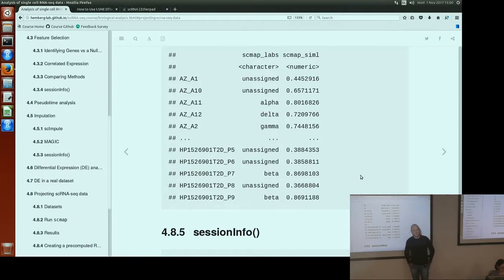So the question is, here we're storing median values of expression in a cell type. Can we store the distribution of the values in a cell type? I mean, for our purposes, we don't need to do that. You probably can, but then storing the distribution is probably the same as storing the whole original expression matrix, right? So you need to know all the values. You don't reduce the complexity of your data set by storing the whole distribution, I assume.